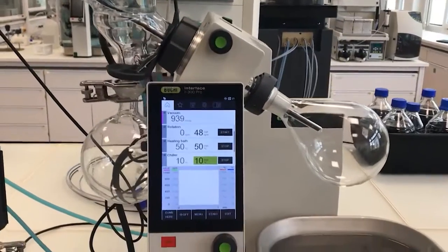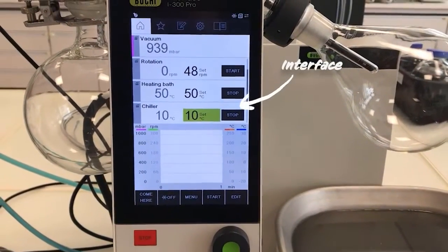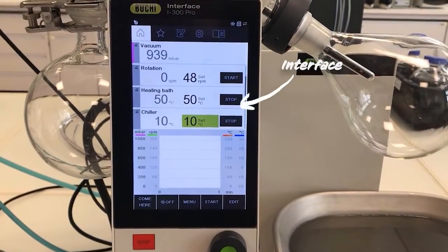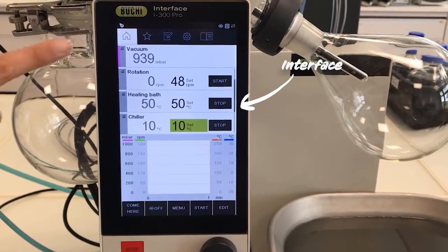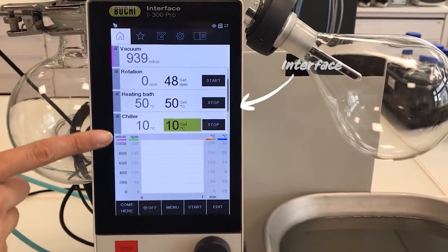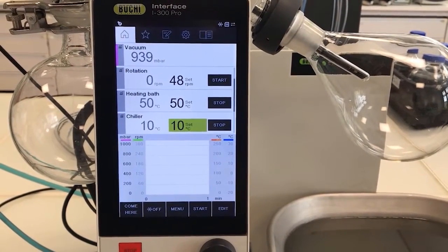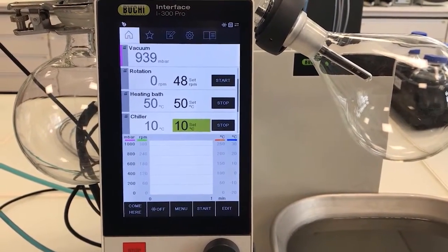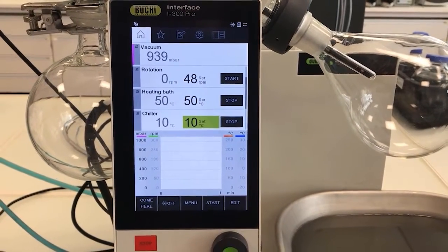Lastly, we have an interface which is the brain of the whole system. It enables the user to control all parameters from one single area rather than setting them individually.